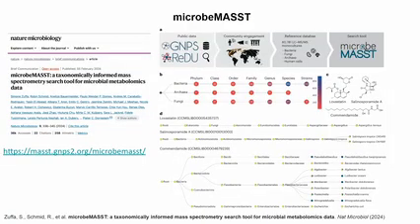We published that paper a year ago now, and the link here is where you can get access. Basically, what is embedded into that infrastructure is 60,000 LC-MS runs of monocultures. It's only monocultures, and if you use that interface, you can say it's found in a monoculture. You just need to be careful: when you get a match, it's found in that monoculture, but if you don't get a match, it doesn't mean that the microbe is not producing it. It's just that maybe the right microbe that produces this specific molecule is not in that database.